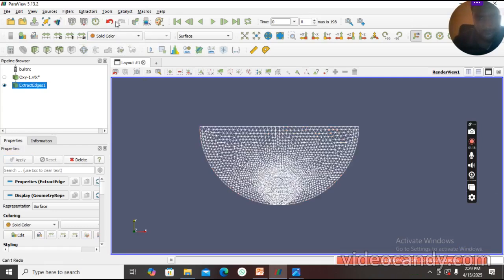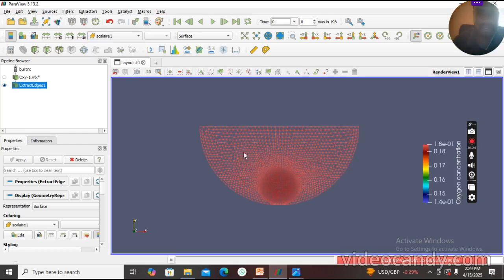I can try to bring it into a solid, how it is. So what does it mean? That cells that are likely to survive are the ones that are concentrated in the middle here, in the middle of the well. So those are the cells that are likely to survive.